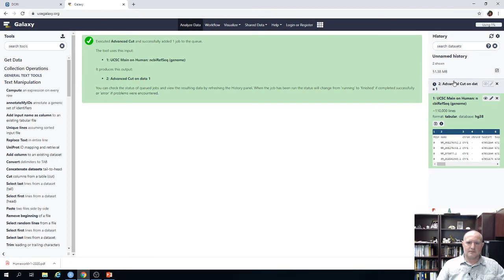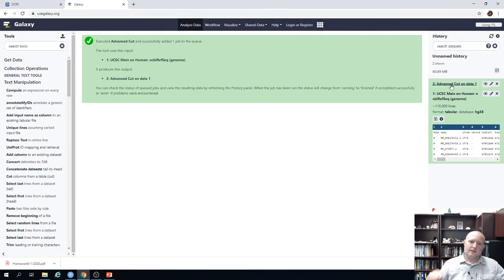So notice again what happens is a new little tab, or rectangle, appears, that is basically going to be the output for that function running on that first table, right? And so now, once it turned brown, that job got sent to the UCSC Browser, and when it completes, it becomes green. And so you can't view it unless it's green. Now sometimes if the server is really busy, or you maybe have a bad connection, that job isn't going to run. If that happens, then I would just wait maybe 30 minutes or an hour and try rerunning it.